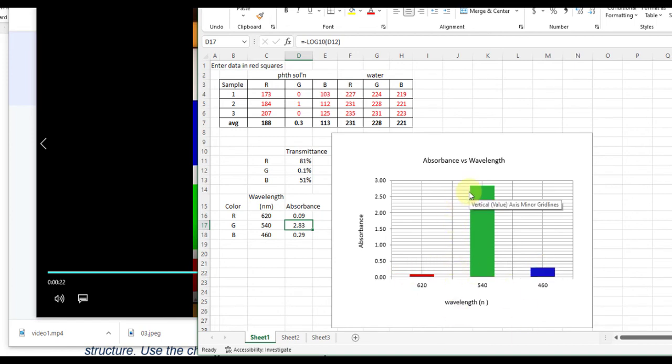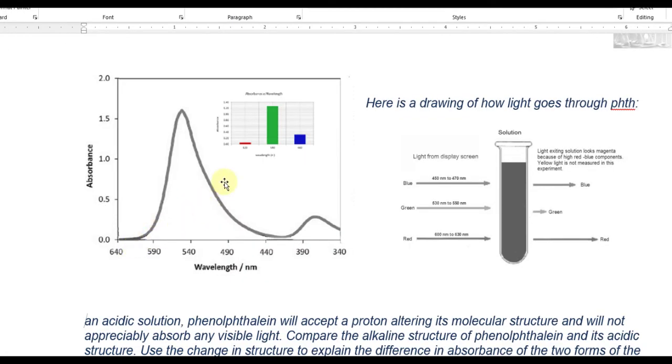Now, we did this with an iPad and a camera, but if you were doing this with an $11,000 spectrophotometer, you could come up with a graph that just didn't have the 620 and the 530 to 550 range and the 600 and 630 range. It would give you the wavelengths for each nanometer.